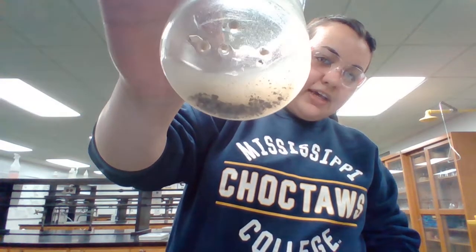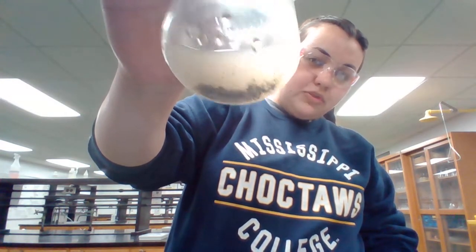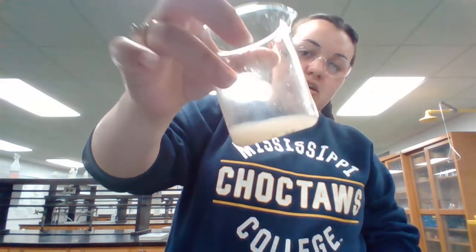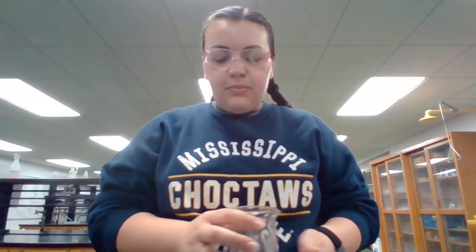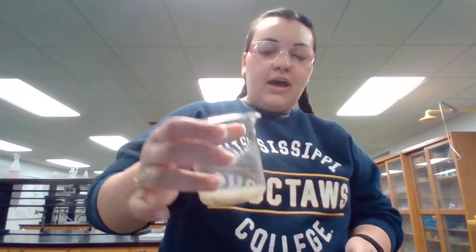Just so y'all can see it, I'm going to have some samples along the way. You can tell I definitely have some large particles in the bottom of this. But like I said, some of the pieces of fertilizer are really hard to grind down to that fine powder. Either way, you'll still have a cloudy solution and you'll still get some decent results. So don't fret if you see some large pieces in the bottom.